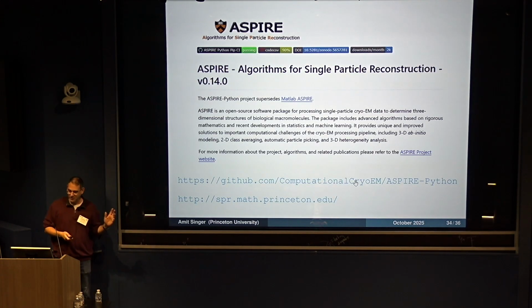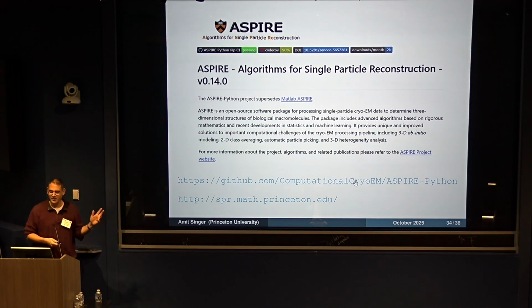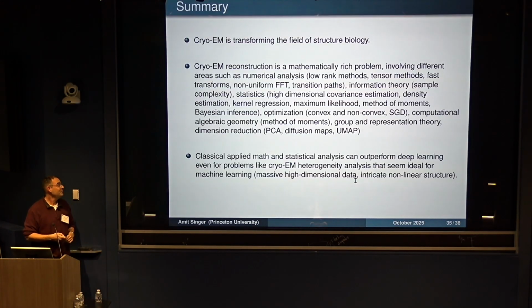Okay, so everything that I talked about today you can also find in ASPIRE. This is our toolbox of computational methods and algorithms for single particle reconstruction. It's in Python. It's open source. You can play with it, make projections, add noise, whatever you want to do.